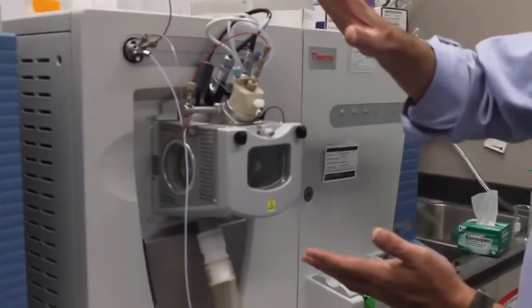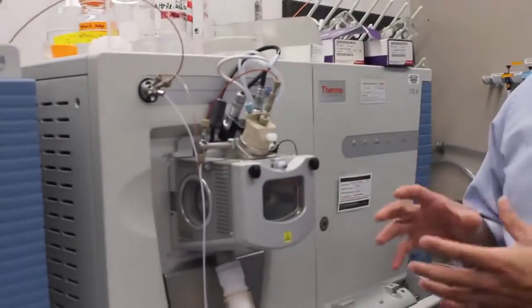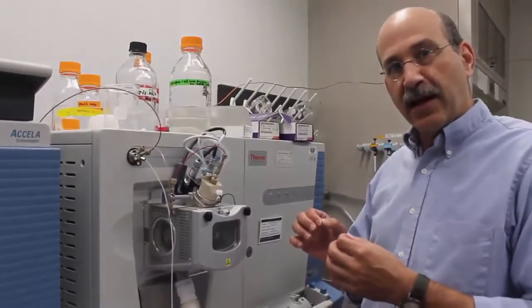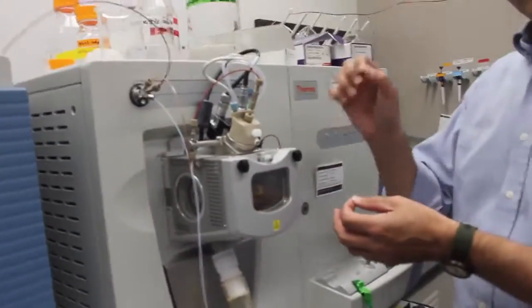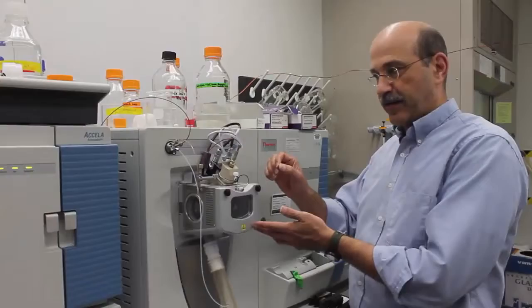So after the analytes are separated, we have to ionize them, because again it's based on a mass to charge ratio, and a charge requires an ion. So we're going to take that analyte and attach an ion to it. Inside is a very, very small needle which is heated, and we put an electric current on that needle. That needle causes a charge to be attached to our analyte ions.